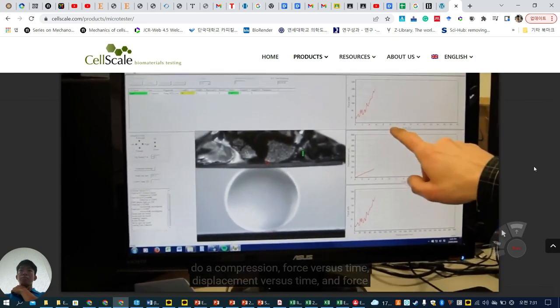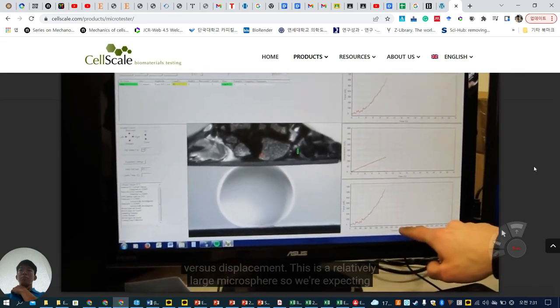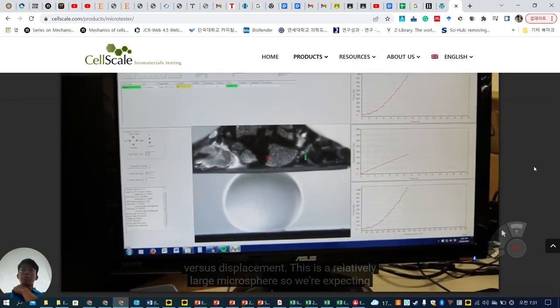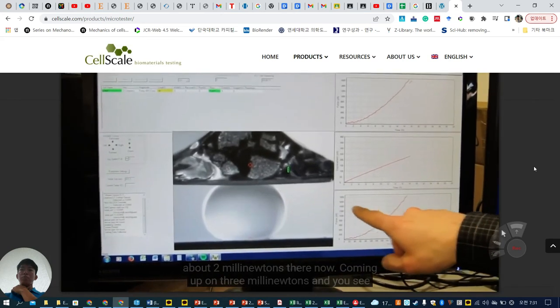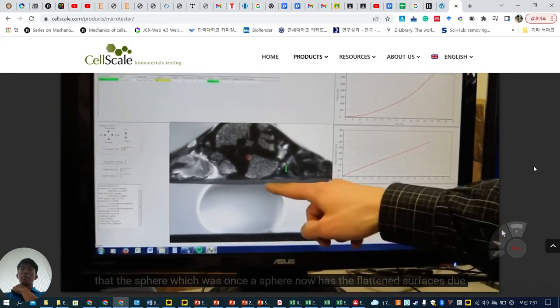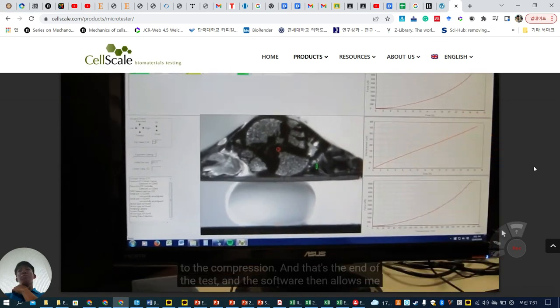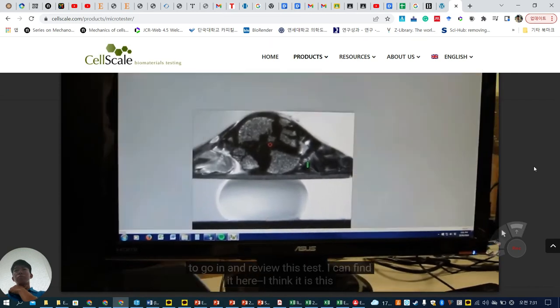Force versus time, displacement versus time, and force versus displacement. This is a relatively large microsphere, so we're expecting forces into the millinewton range, and that's what we're getting. We're hitting about 2 millinewtons there now, coming up on 3 millinewtons. And you see that the sphere, what was once a sphere, now has flattened surfaces due to the compression. And that's the end of the test. And the software then allows me to go in and review this test.